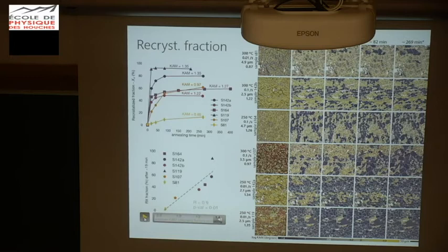Well, this one is not working, but it's just to comment that this strong correlation is weaker over time, mainly because of this sample here, the one in orange, because as you can see, this path here broke the trend. So at some point, this sample attained a highly recrystallized fraction compared to counterparts that have high initial CAM values. That's it.